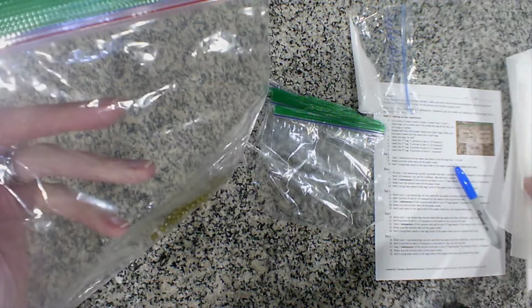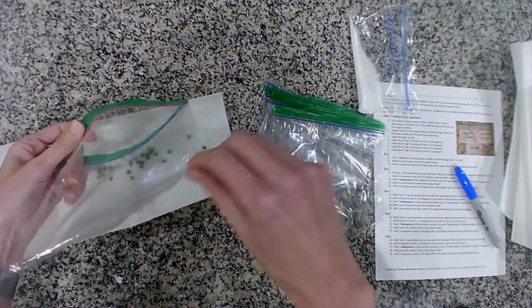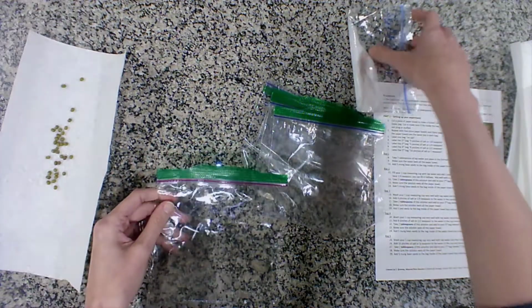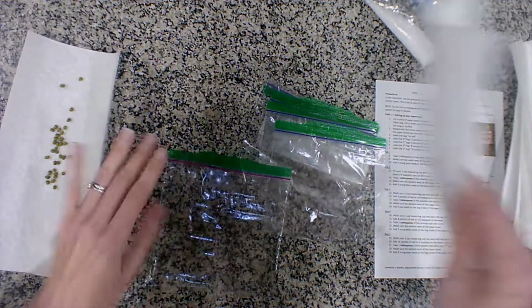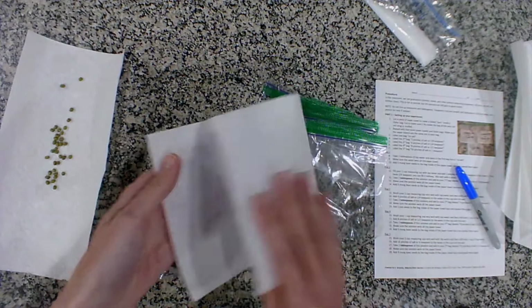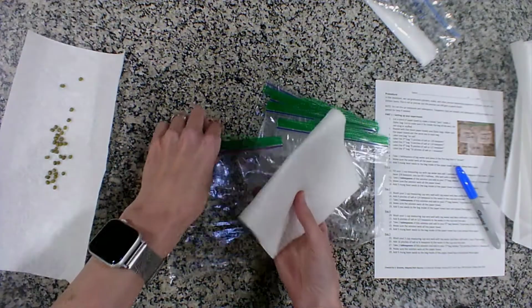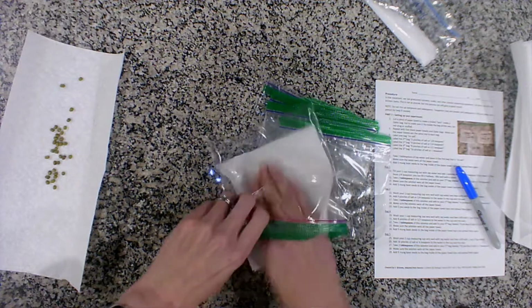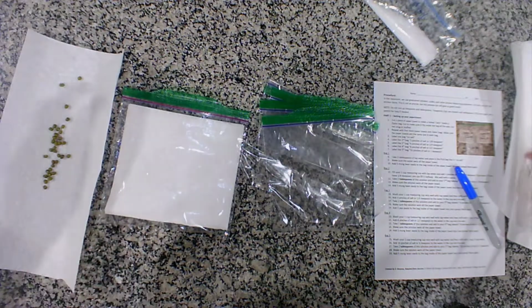Okay, so what I'm going to do is take these mung beans and pour them out onto a paper towel because I'm going to need a bag. All right, put those over the side. According to the instructions, it says cut a piece of paper towel to make a folded taco and put in each bag. What actually works perfectly is this one, just one of the selected size. If I just fold it in half like a taco, and then I stick it inside the bag like this, and then I'll do that for all 5.